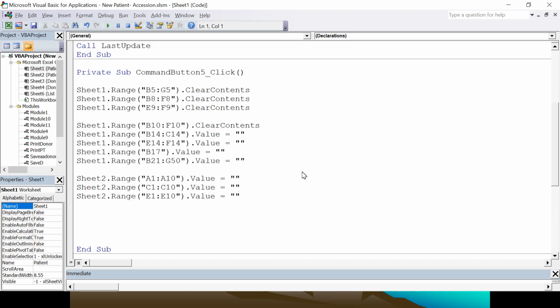For a stem cell lab or cellular lab, there are very few users and very few tasks, so speed is not a major concern. When you do the programming, the key part is being reliable and working as you designed. So optimization is not like for a regular software developer, who wants the speed. That's not a major concern here.